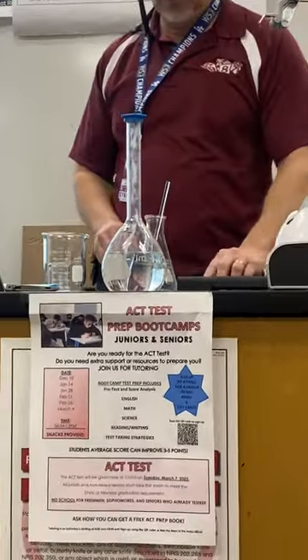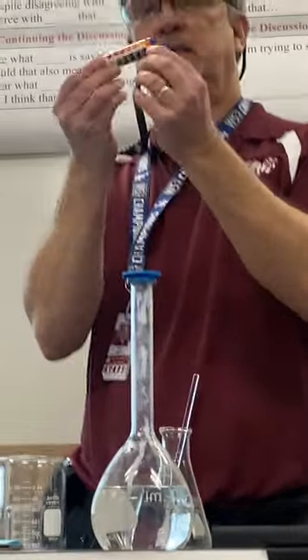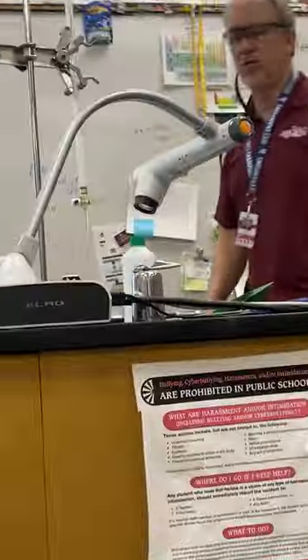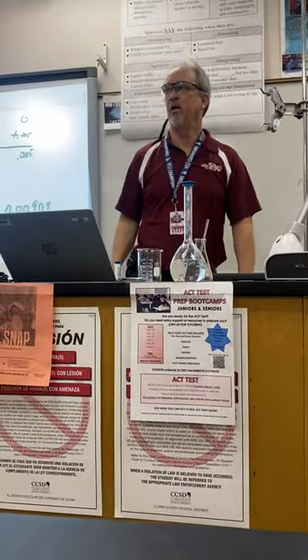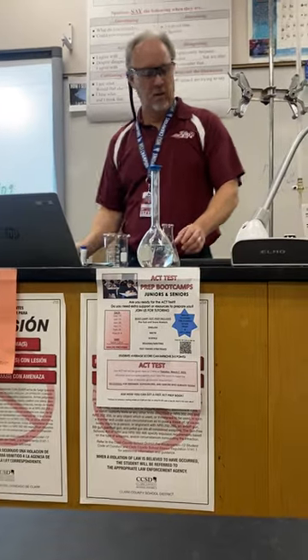Touch it and it turns. That is definitely acidic, somewhere on the acidic chart. Throw that away. You're going to have to do three trials. I'll do one trial in probably less than 10 minutes. So you have an hour and a half to do three trials. You should be able to do in an hour and a half what I can do in 10 minutes.